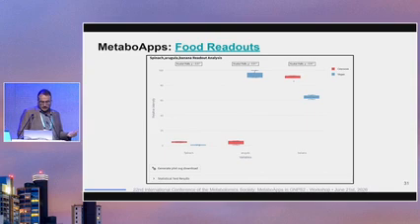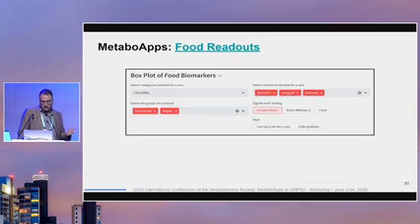So basically, you can see as a relative intensity the information on the difference of the metabolites related to spinach. In this case, those are the ones that I've selected for the example. So you can see the difference of the intake of spinach, arugula, and banana based on the metabolites that we have curated for those foods. And then also, just going back here, you can select those 3 different significance testing, Kruskal-Wallis, Mann-Whitney, and t-test.